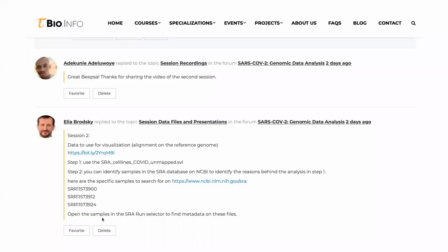Okay, yes. So again, you're going to have some more time to do this. I think it will really help you understand what can go wrong when you try to do this on your own. If you are able to reproduce it correctly, it will also give you a sense of how to do it next time and apply this to a project of your own. So please take the time. We'll go through these steps again today so that we go slowly and carefully, and you will be able to see how to do this. So if you want to follow along, please follow along.